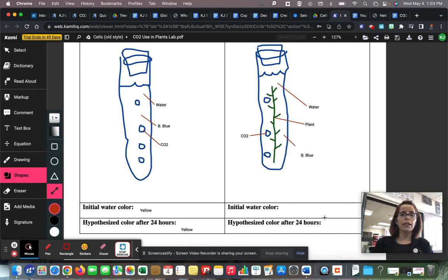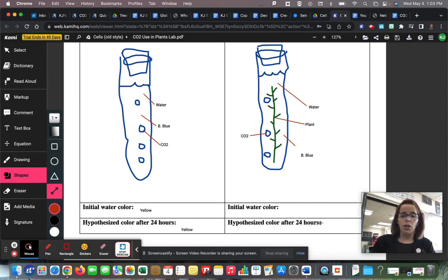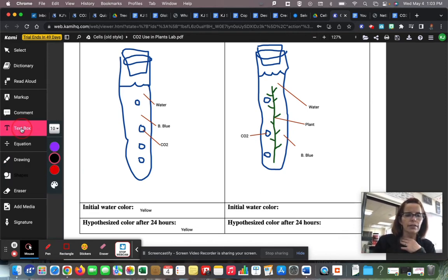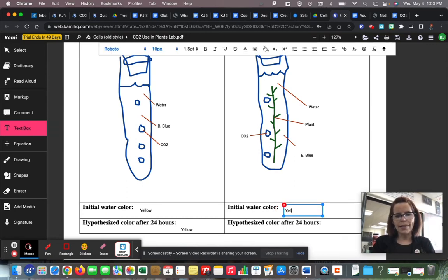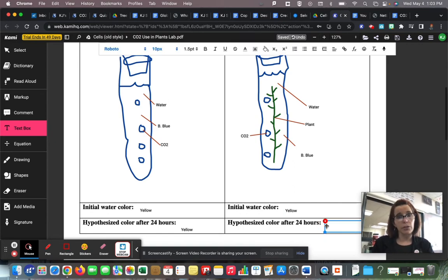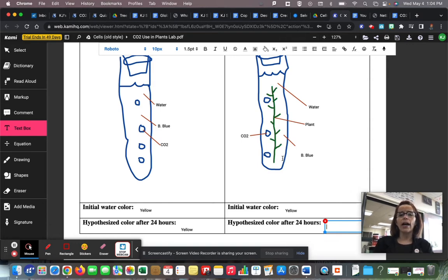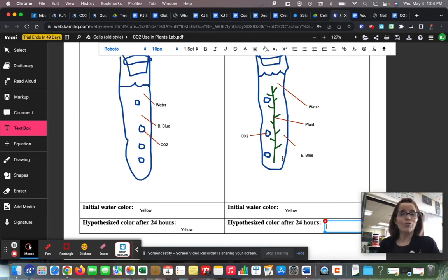The control group does not have a plant and the experimental does have a plant, so we're going to see which one changes color. The initial color for both was yellow. The hypothesized color after 24 hours — what color do you think the water will be if it's yellow right now and I put it in the sunshine? What color will it be when the plant photosynthesizes and sucks carbon dioxide out?